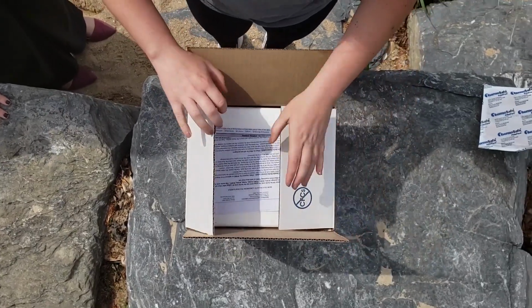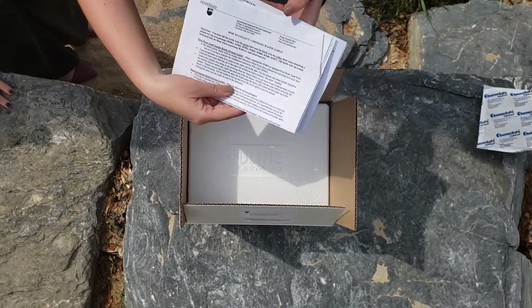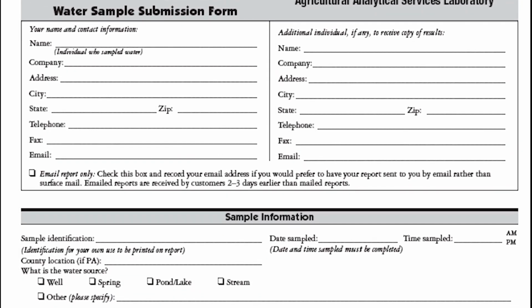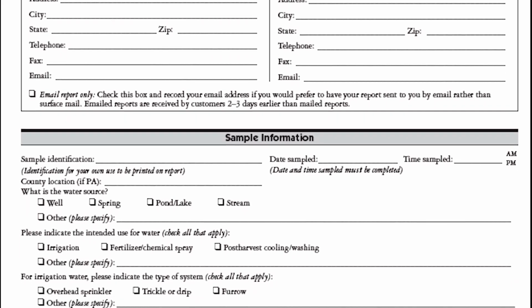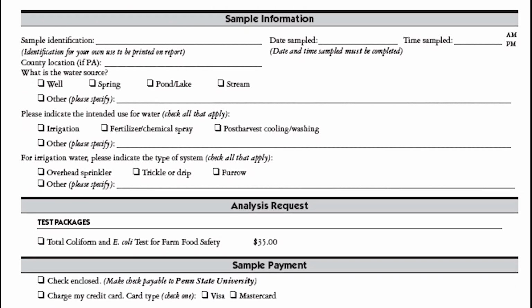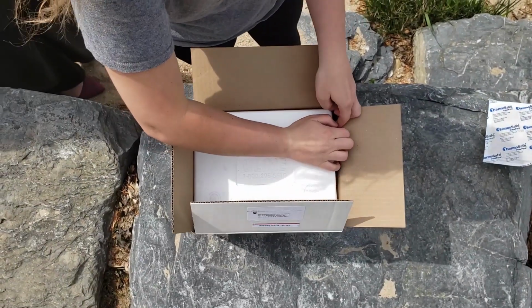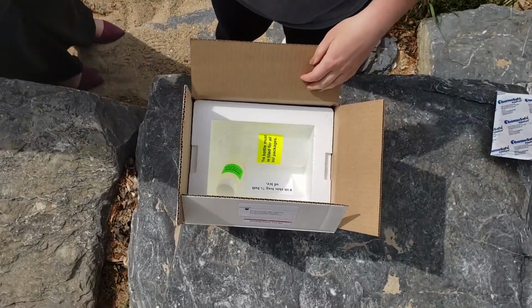Inside your sample kit, you will likely find detailed instructions pertaining to water sampling, shipping, and payment, as well as a form for you to complete with information about where you're sampling, what water characteristics you want tested, and your payment information. In order to be Produce Safety Rule compliant, you will need to test for generic E. coli. Your lab may provide you with an insulated box to ship and protect your water samples.